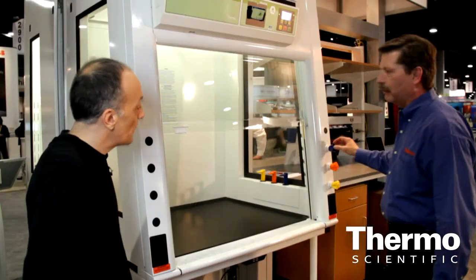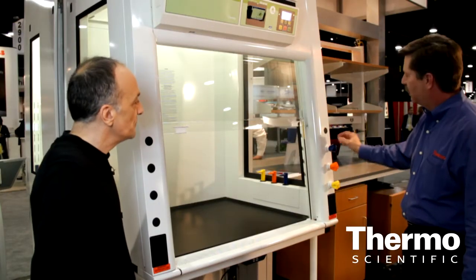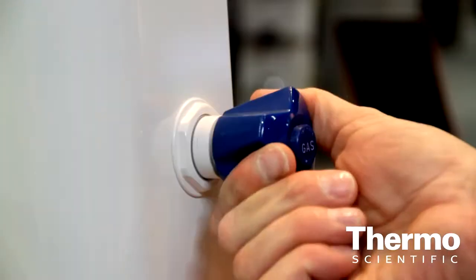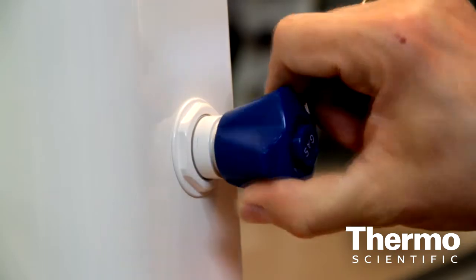This green fume hood technology is all about energy savings. Rick, tell us about the service fixtures. Some of the service features we've incorporated into the side post are front-loaded valves that control gas, air, and vacuum. With these service fixtures, you have the off function.